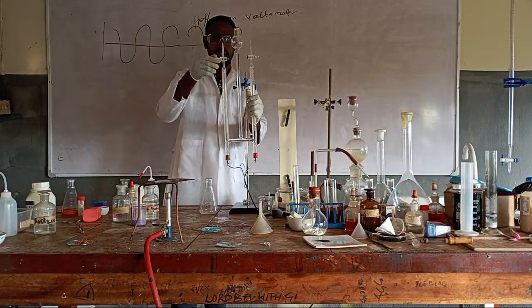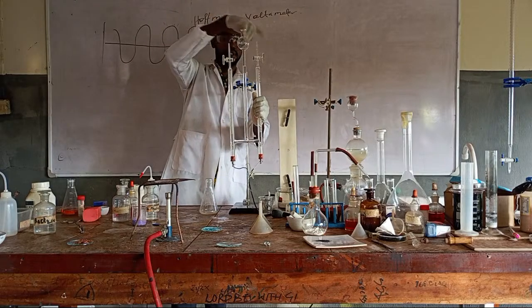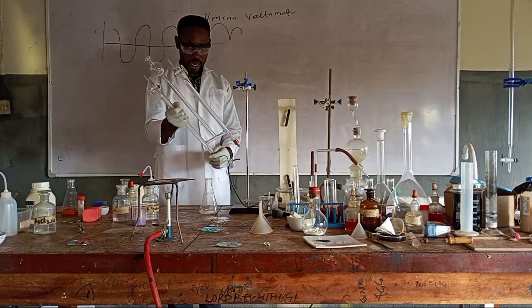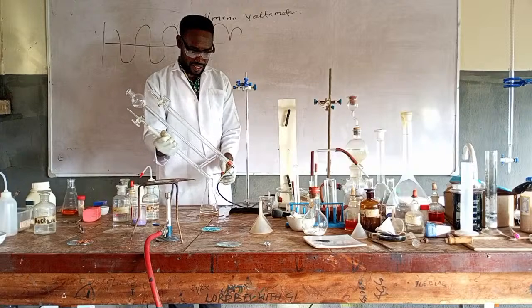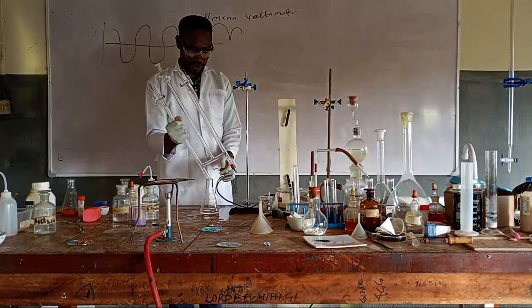See what I mean? Are you seeing it? That's, I've displaced the gas formed. So I want to collect the water back and I know it will pour now because I will open it.